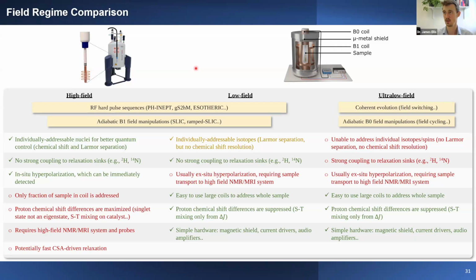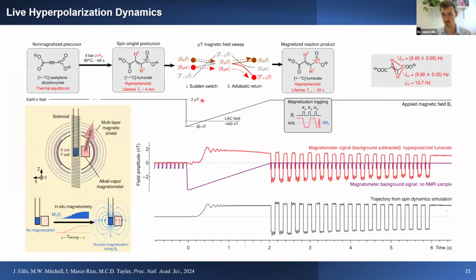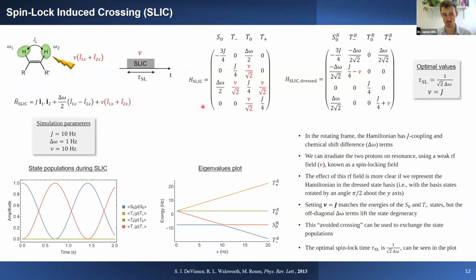Yeah, so in a CP experiment, I don't know exactly how it works. I think in a CP experiment you're irradiating two spin species, and you're using very strong irradiation. With a SLIC pulse, I'm not sure I can answer that so well because I don't know exactly how CP experiments work. These are solid state experiments where you have some very strong spin locking field. In this case, you're doing a spin lock of just one species, but it's incredibly weak. With this SLIC pulse, you're just applying a transverse field.